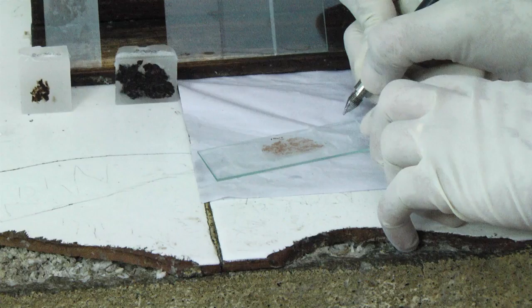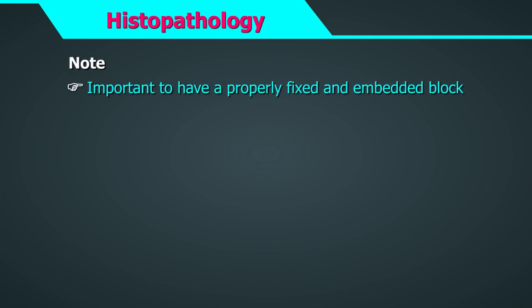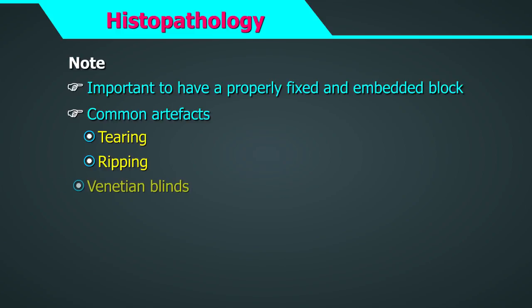It is important to have a properly fixed and embedded block, as artefacts can be introduced during sectioning. Common artefacts include tearing, ripping, venetian blinds, holes, and folding.